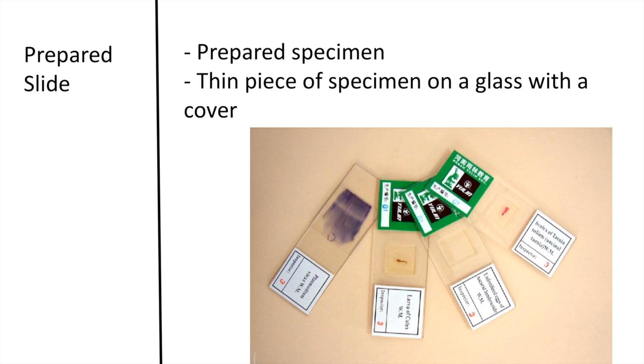A prepared slide is a specimen that has been stored and preserved onto a slide. Here are some examples of slides that companies have made and sell, and they are preserved specimens. So you can use them over and over again.